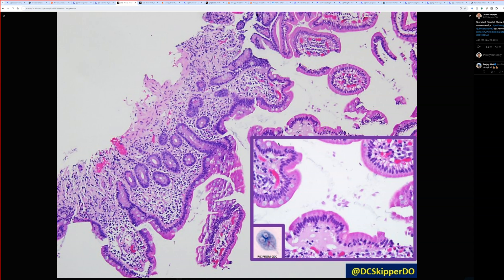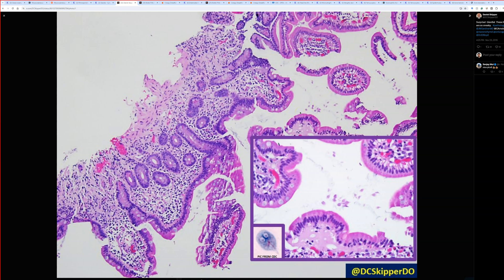And I know I do skin and soft tissue normally, but I still like weird organisms even in other places like the GI tract. So here's what we see in the small bowel here. We've got the villi, and then in between the villi, we've got the little fallen leaves, right? Kind of hanging out there in the space. So you've got to always look in the spaces there and make sure you're not missing stuff.